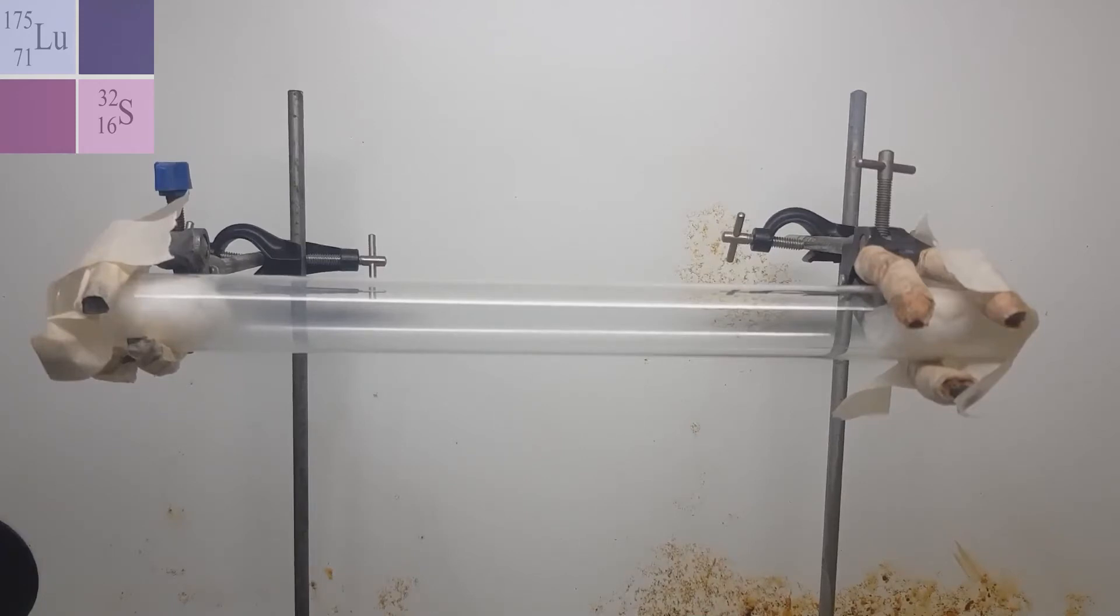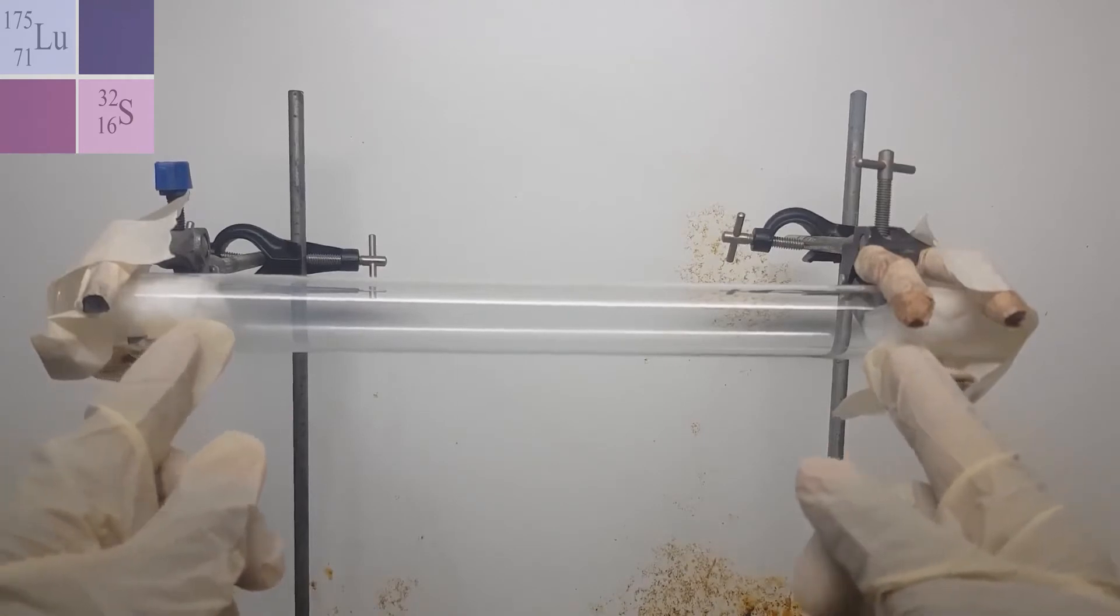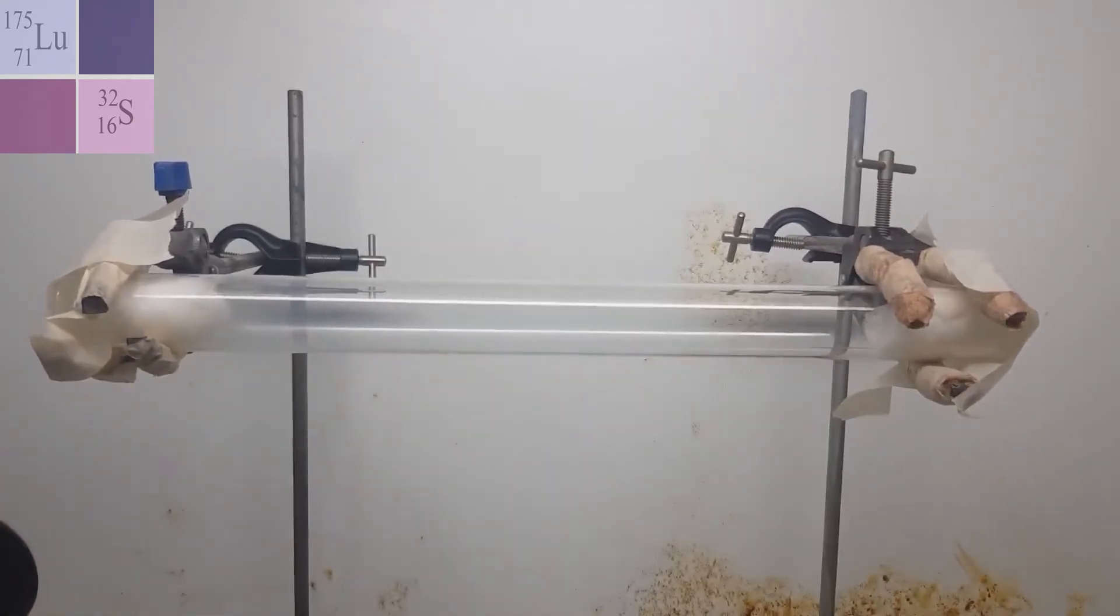Now we can actually measure the distance which these two gases travel using here and here as the starting point of each and this length as the length along which they travel. So we could actually measure the distance moved by each gas before they meet.